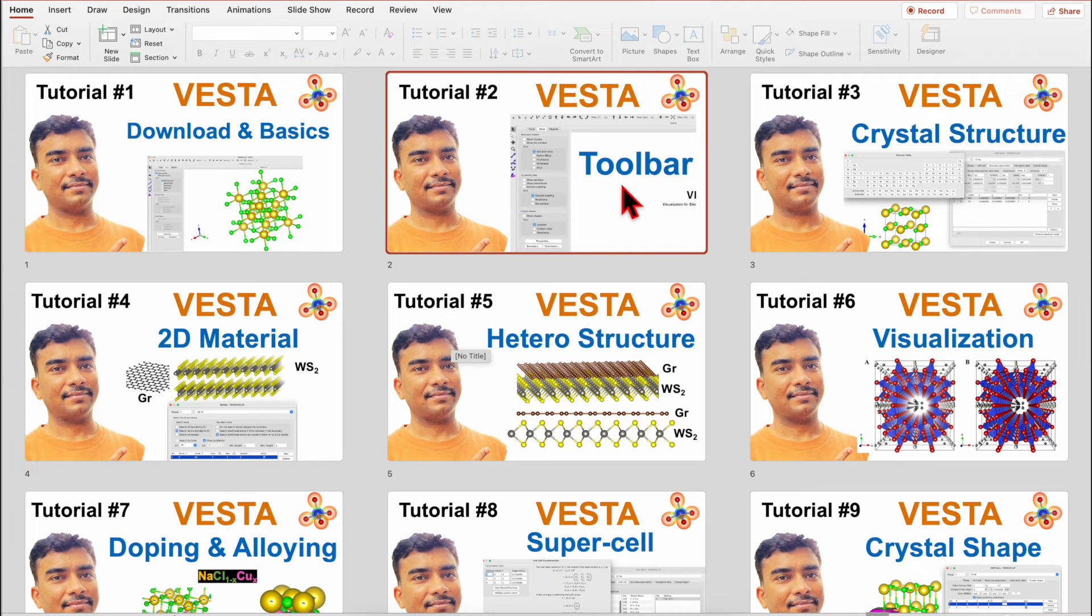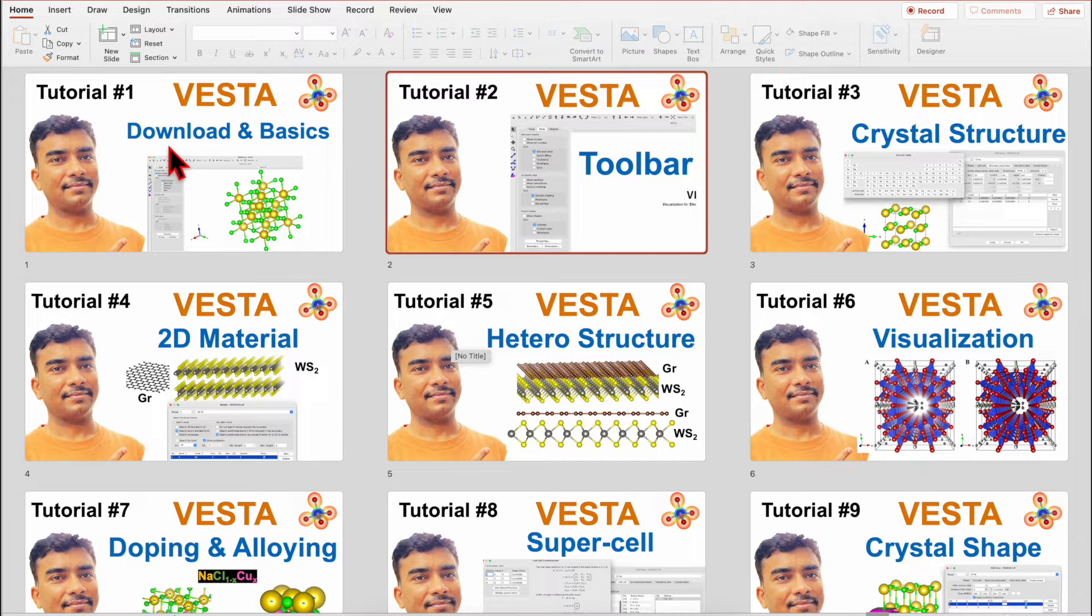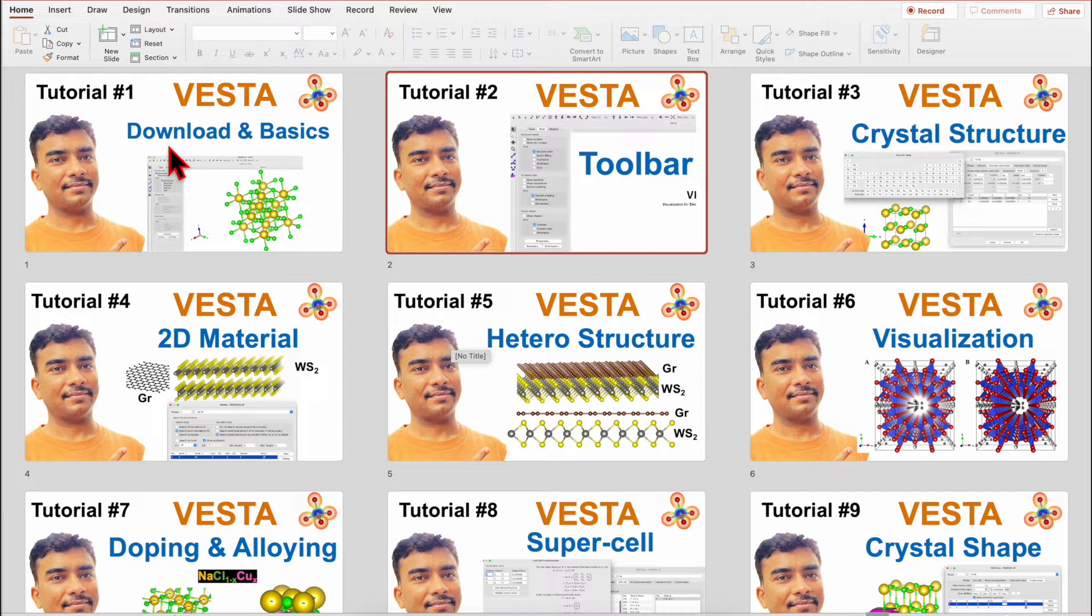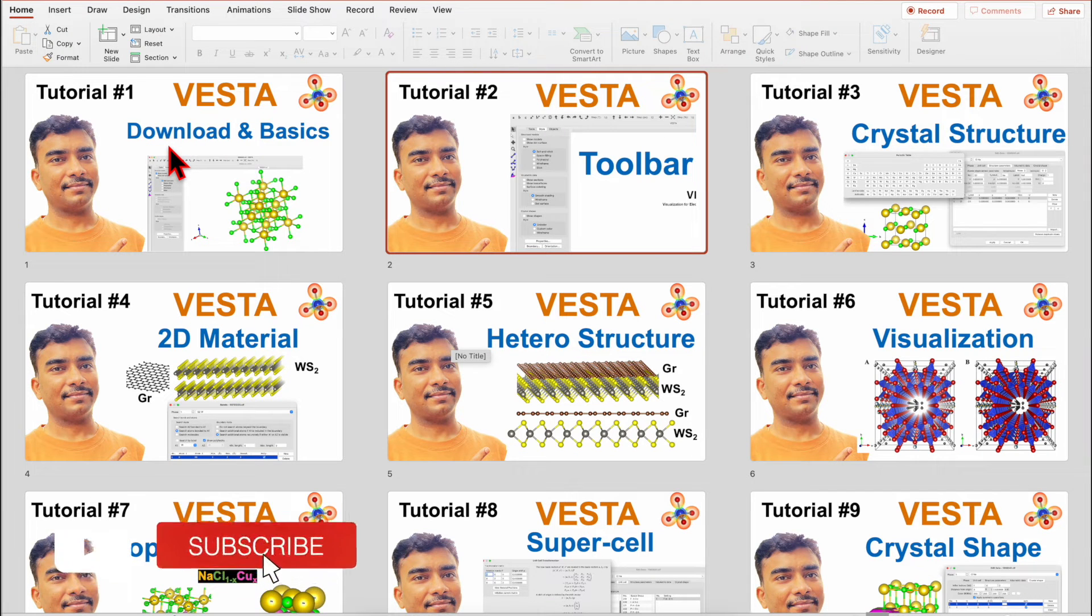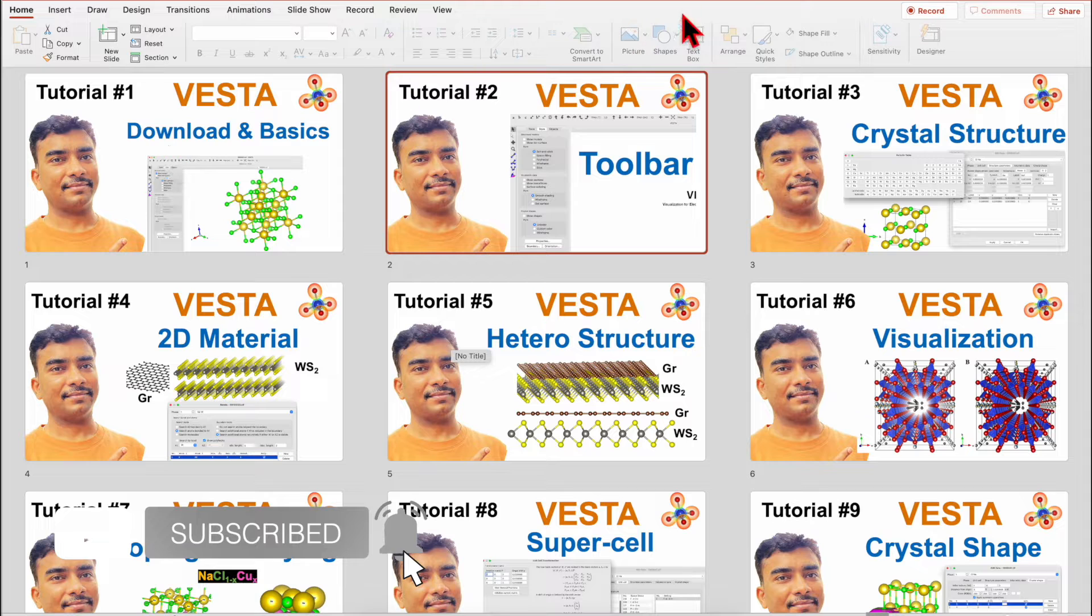I will introduce the toolbar in Vista software. In my tutorial 1, I have already shown you how to download Vista software and also I have introduced a website from which you can get CIF files for free.